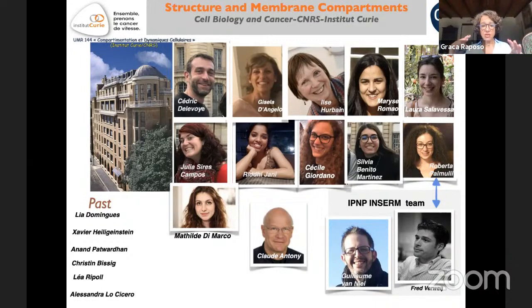It's now very interesting to understand the subcompartmentation within the nucleus, because you have the nucleoli, and I'm sure we have compartments in the nucleus. These proteins, even if they are fixed, are going to continue moving because they are not attached to membranes. So the only thing is to label, cut, and label. And try to fix with glutaraldehyde if the antibodies work with glutaraldehyde.